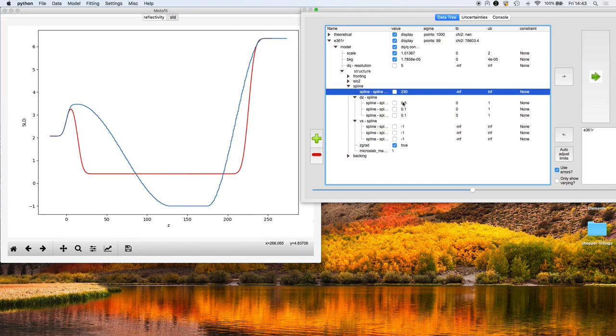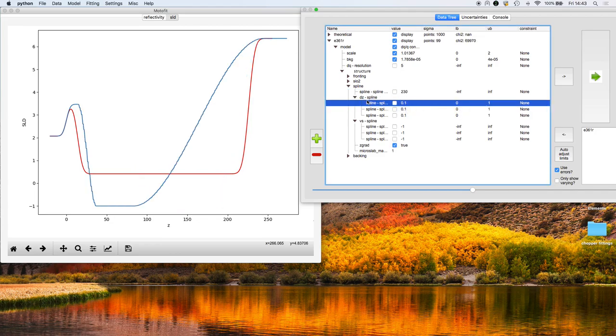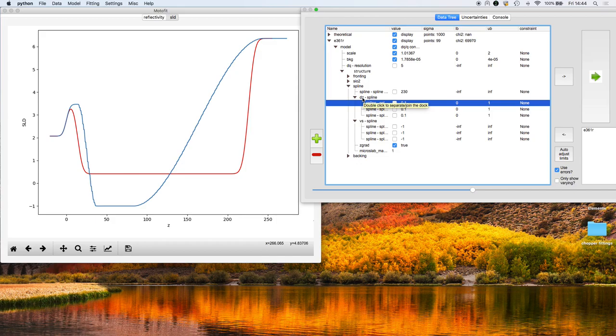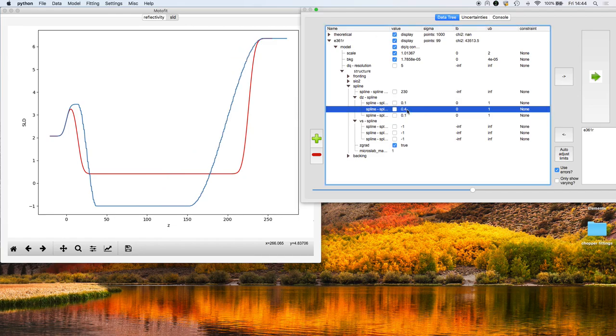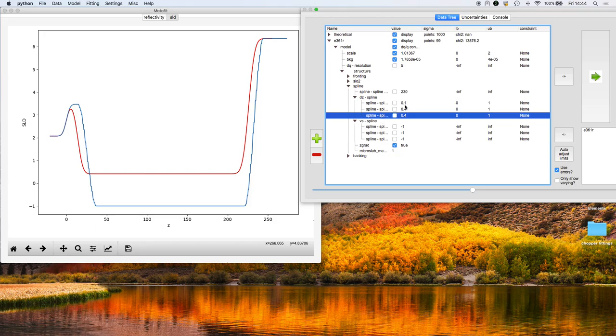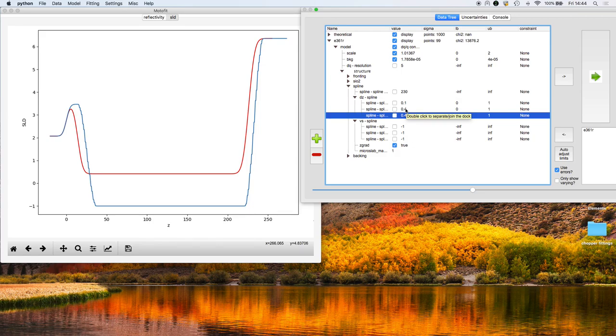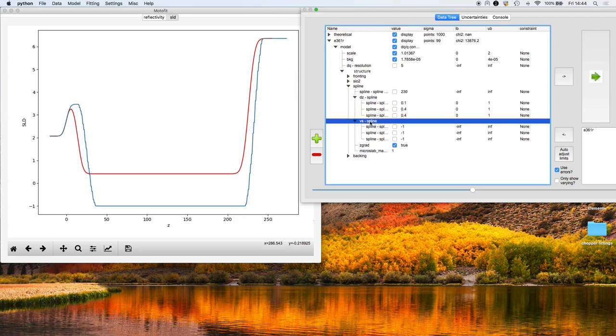These dzs here describe the spacing of the knots, the control knots, within the spline. They're dzs because it's a distance. This 0.1 refers to 10% of the way through this total spline extent, so the first spline would be at 23 angstroms. The next one would be halfway through because 0.1 plus 0.4 is 0.5, so it would be 115 angstroms.